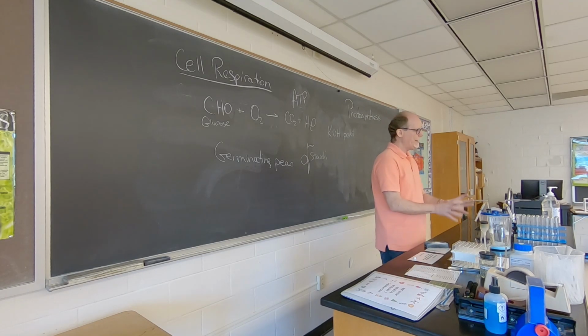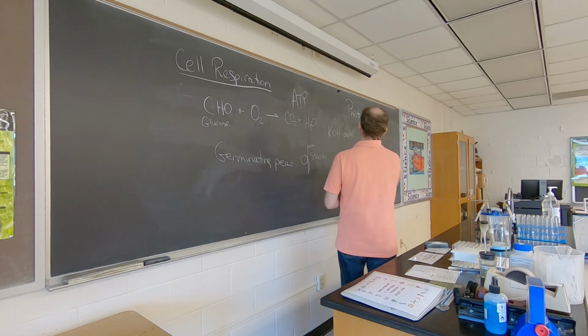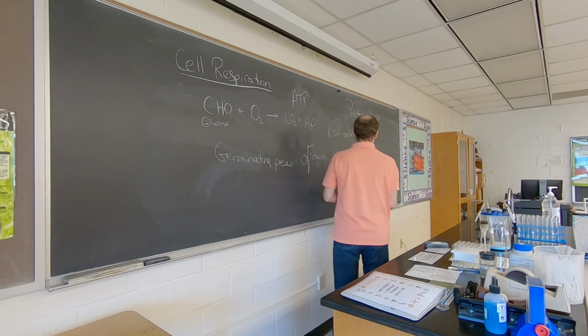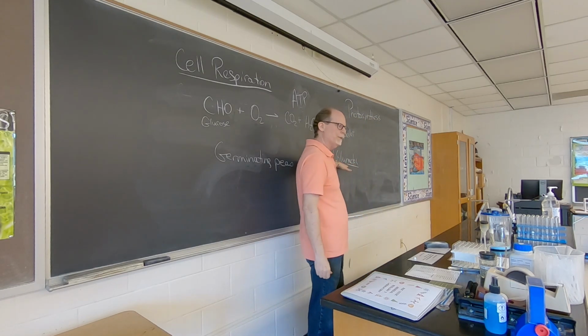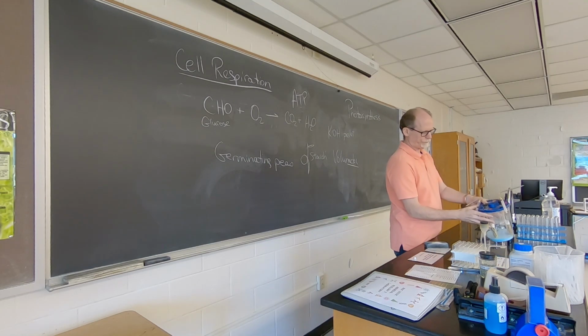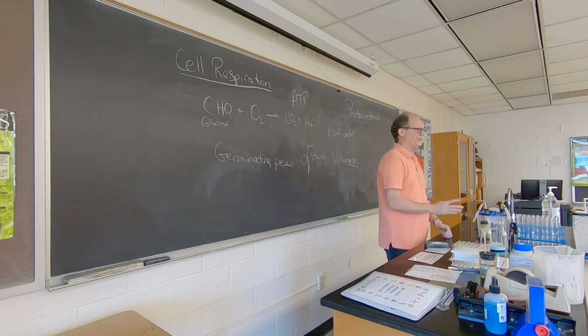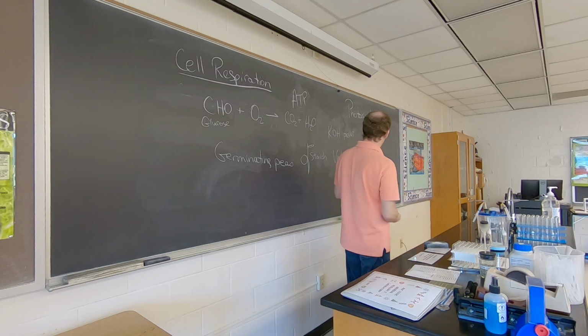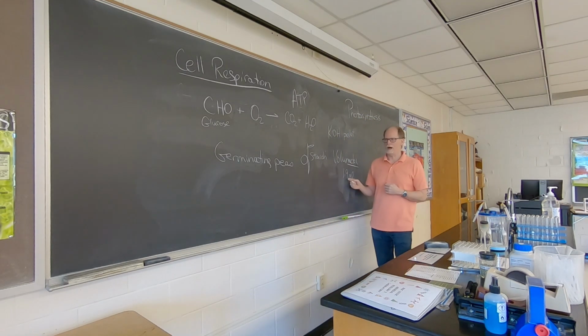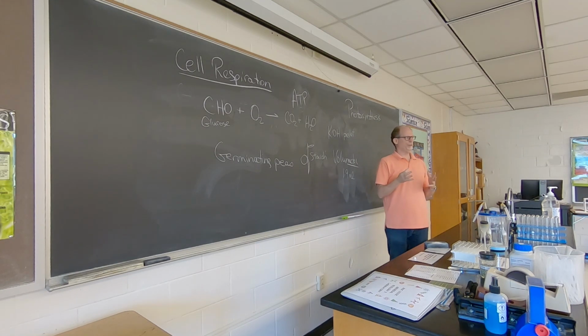So the volume meter, that's the name of this. Meter means it measures volume. We're measuring using this pipette here. It's telling us exactly how many milliliters. In one lab it might be like 1.9 milliliters of oxygen gas consumed in about an hour.